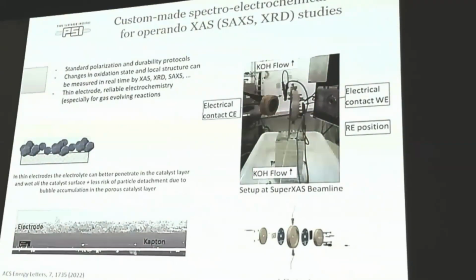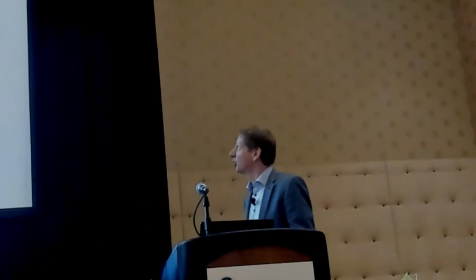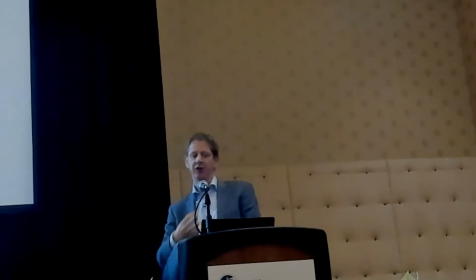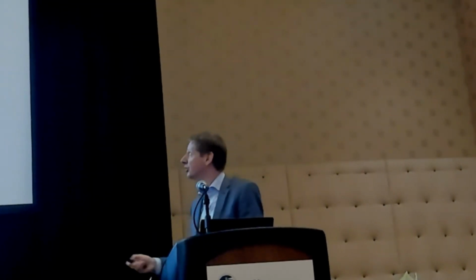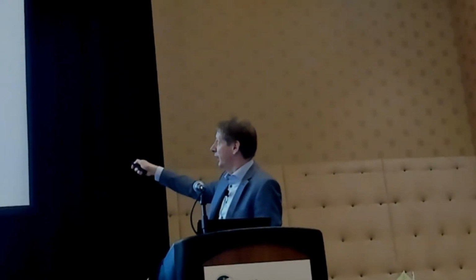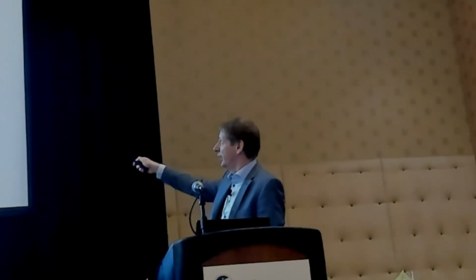That's where we should have stopped. But we like to go around and move the goalposts. We kept on going. We developed a setup ourselves to do these electrocatalytic studies really as close as possible to experiments that you would do in the lab, right? Still RDE. So we have a thin electrolyte, we have a thin electrode, we have a flow of the electrolyte, and we can basically run our standard polarization and durability tests.